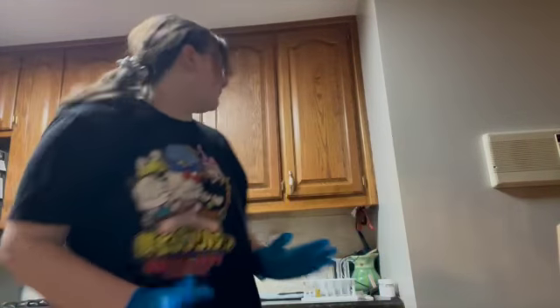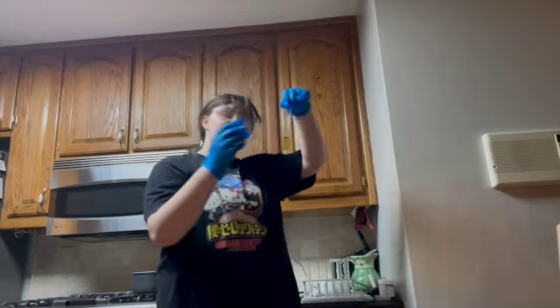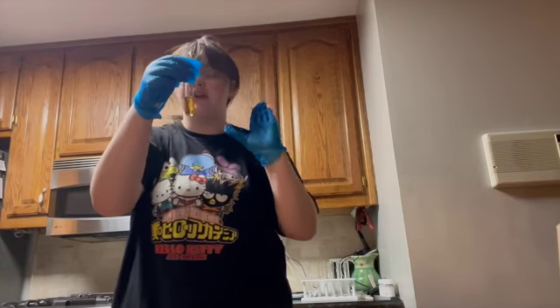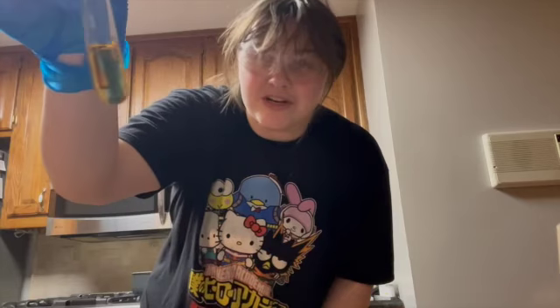Okay, so we reached our 14-minute mark, and our solution has changed from that little bit of orange at the bottom, with the rest of it being red, to now completely being this orange or even amber colored.